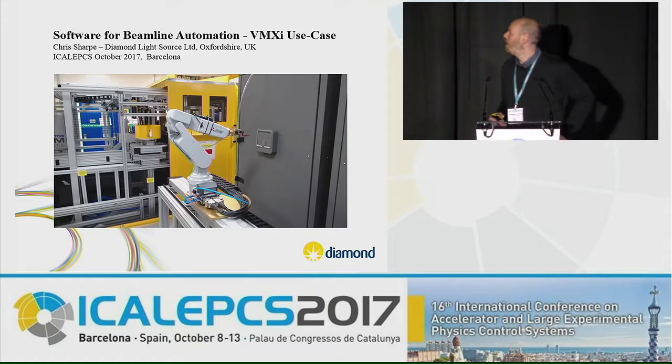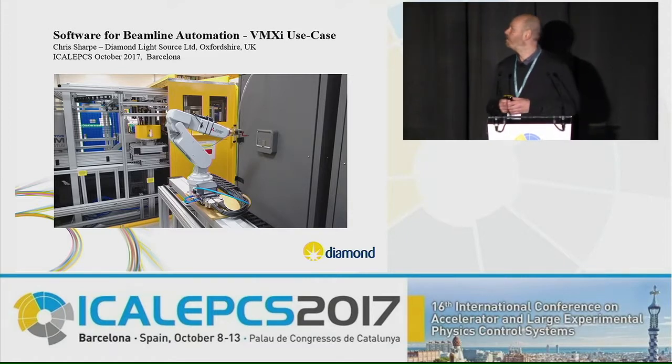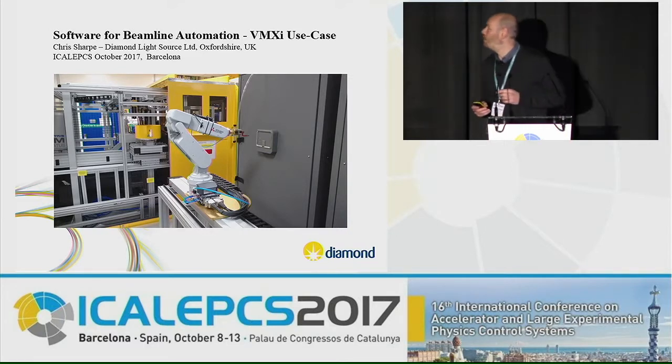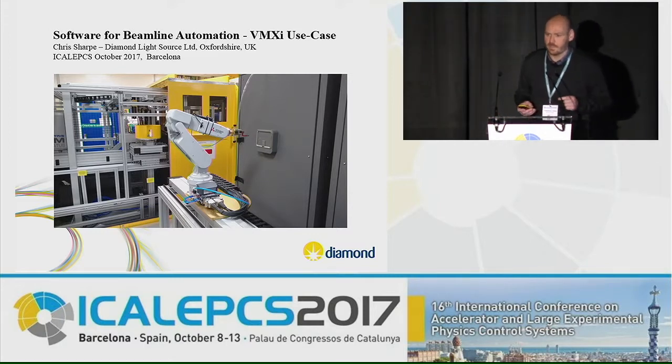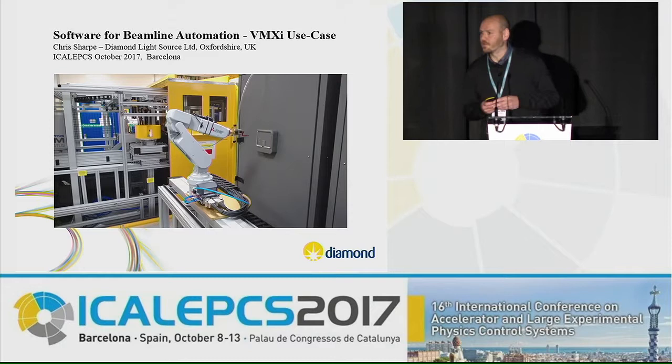Morning. My name's Chris Sharpe, and as I said, I work in the data acquisition team at Diamond Light Source. So my talk is on how we actually managed to automate a Beamline without changing the data acquisition software at all, which is a challenge.